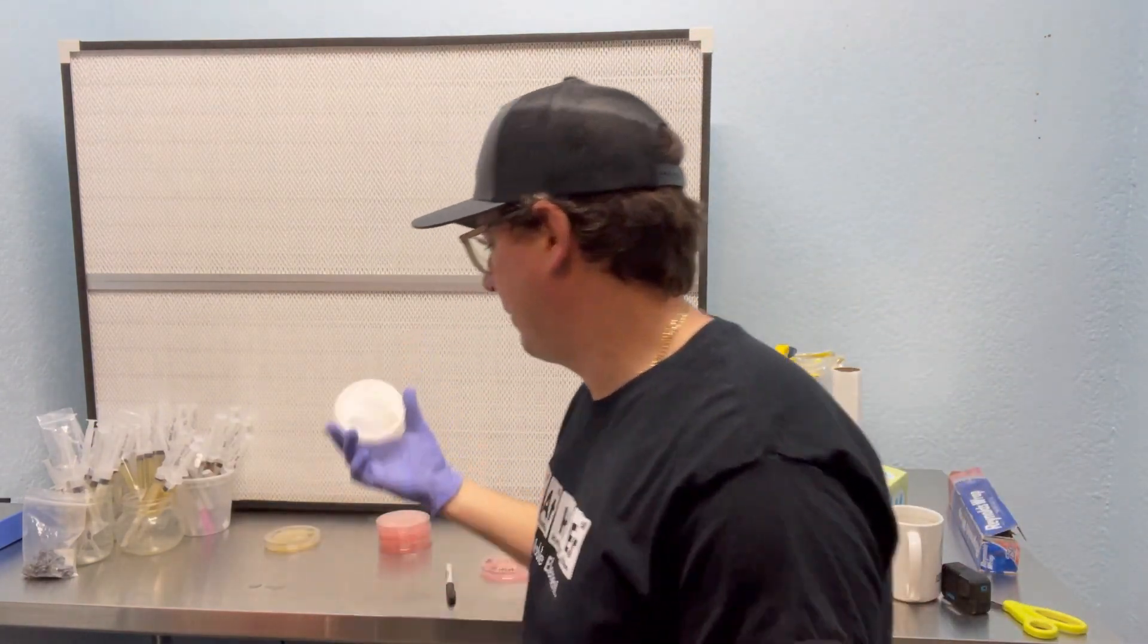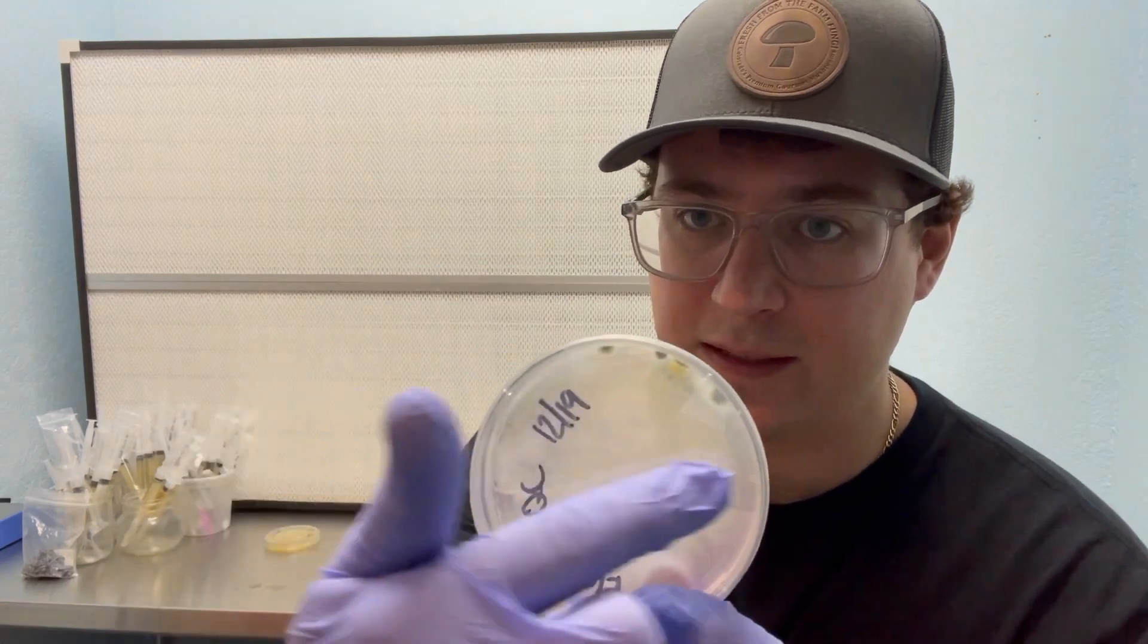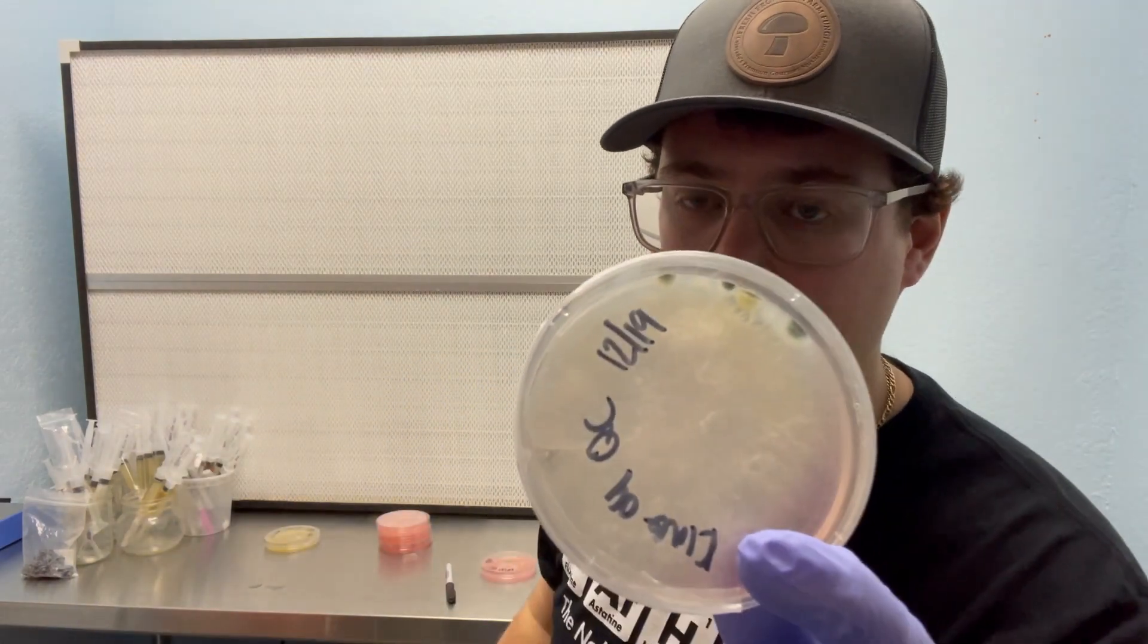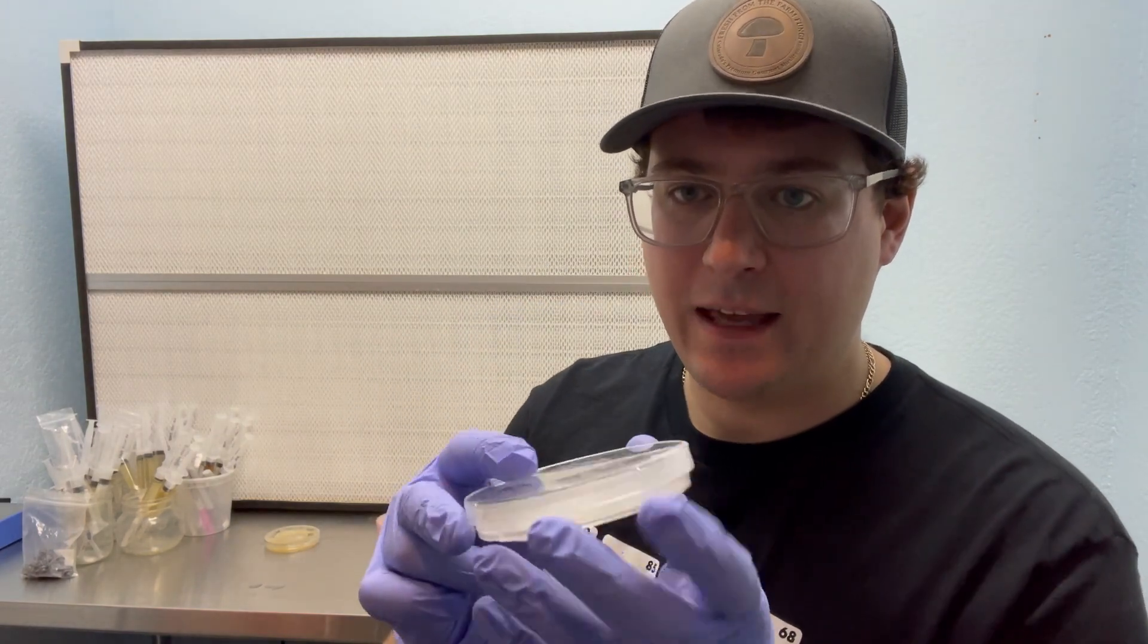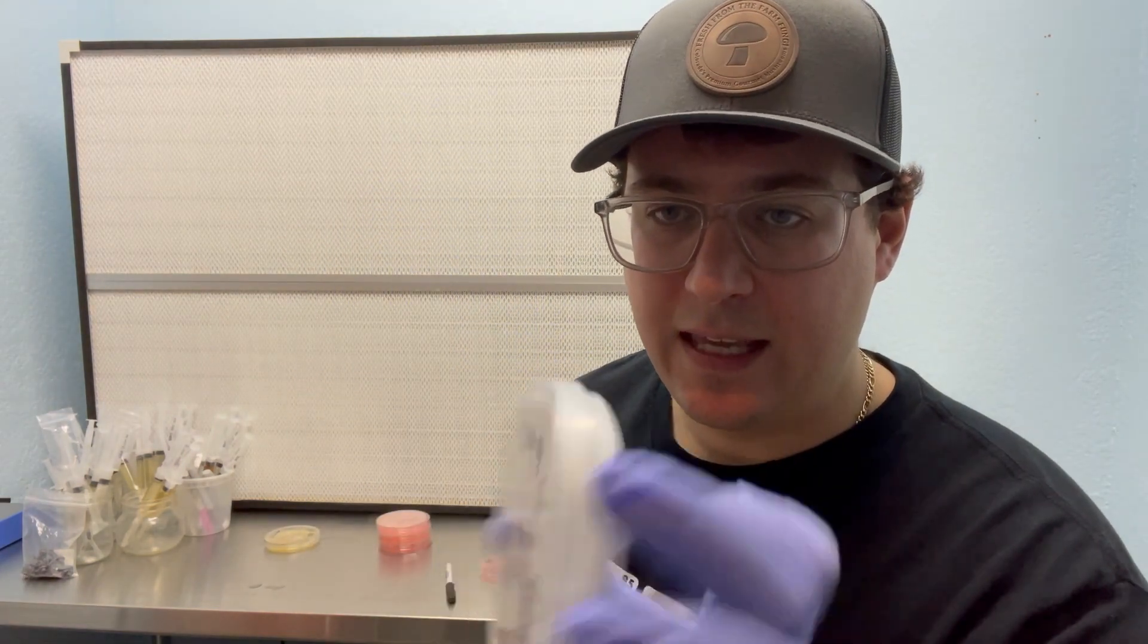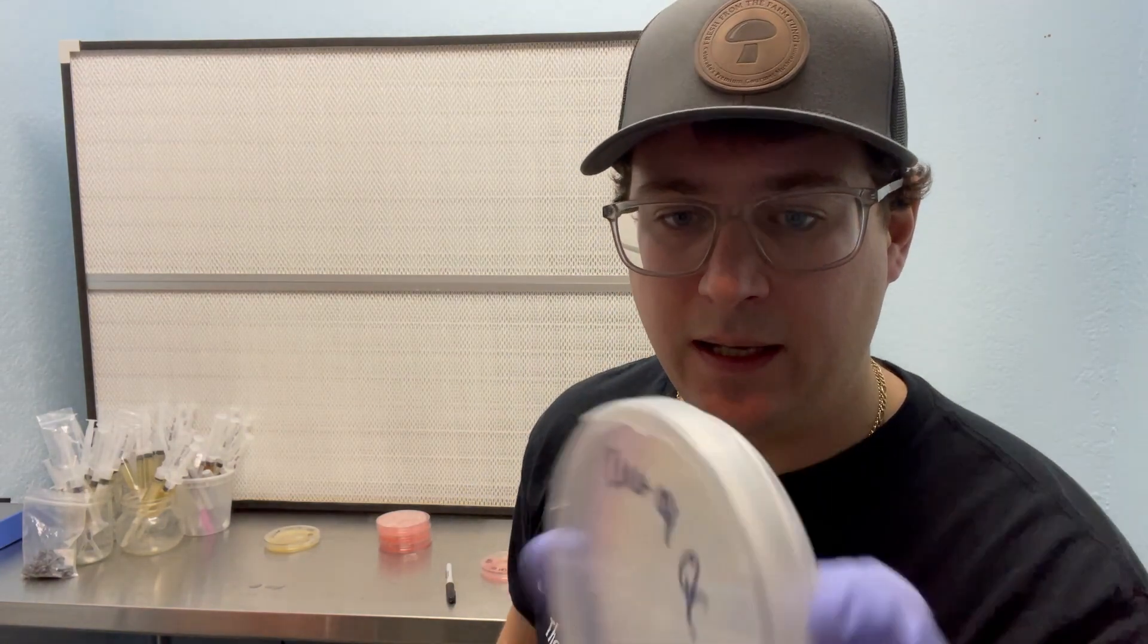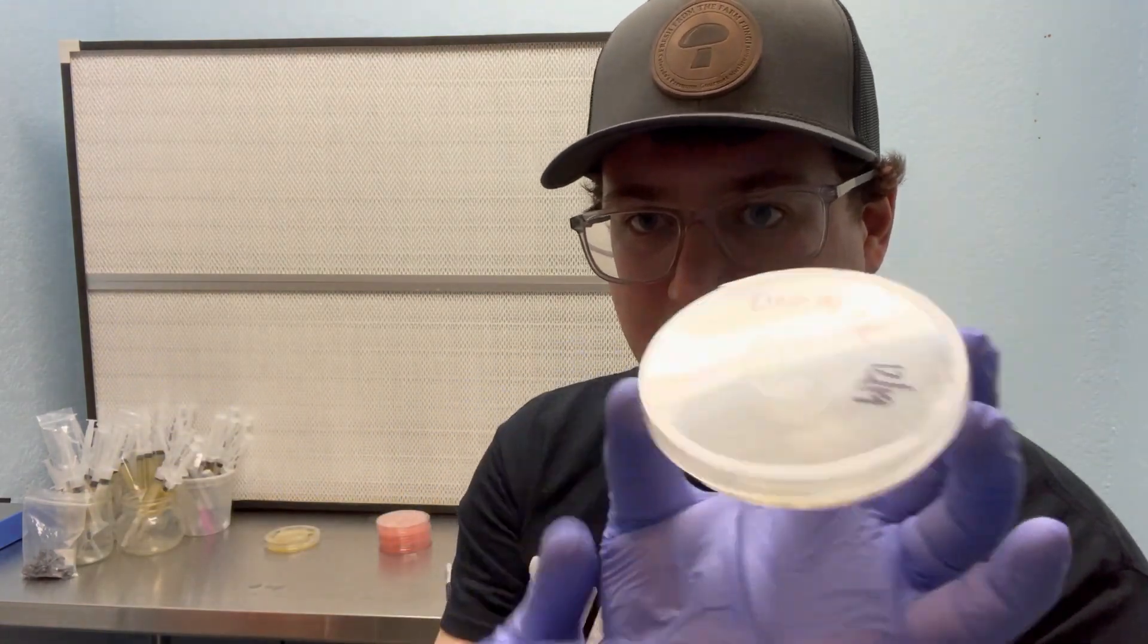Another example of a contaminated dish that probably happened from me is on this plate here. You can see right around the edge, there's some trichoderma or potentially some more penicillium. And that probably happened when I was working with a dish and some contaminants fell near the edge. So this king oyster is also very salvageable.